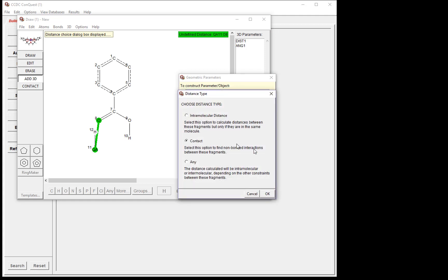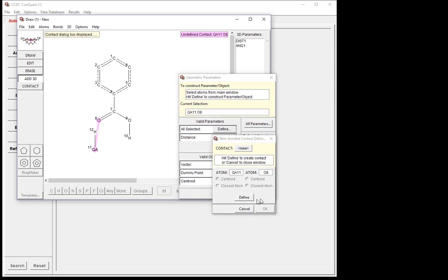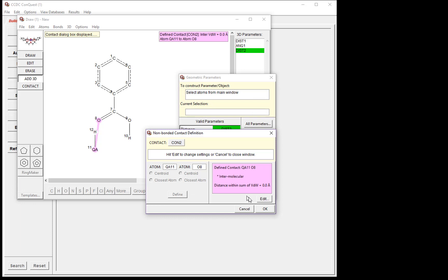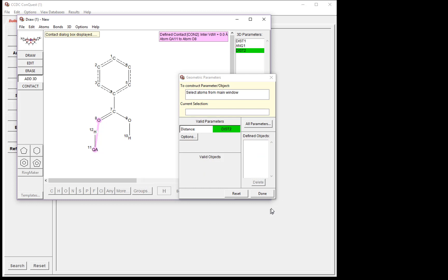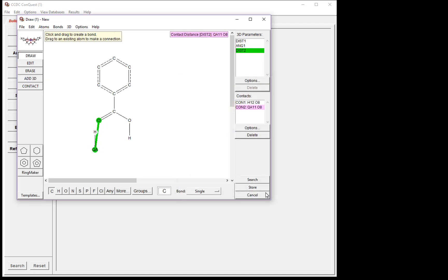Again, we choose Contact, so click OK. We click Define to define the distance, and OK, because we don't wish to edit the interaction parameters. Now you'll see we have Distance 1, Angle 1, and Distance 2 in our 3D parameters list. This is all we're interested in investigating right now, so we'll click Done in our Geometric parameters window.